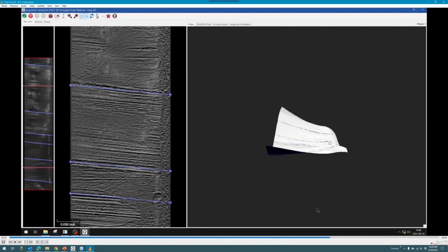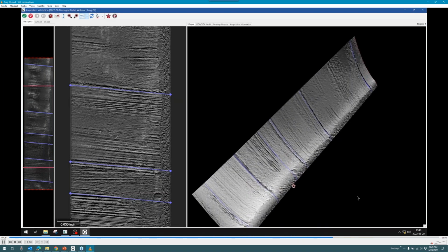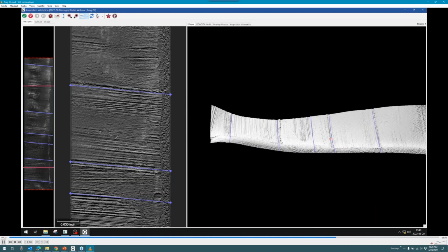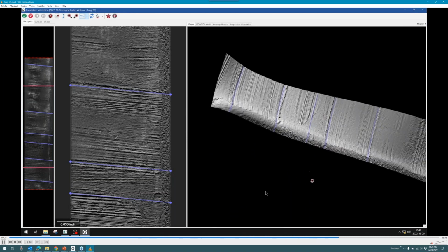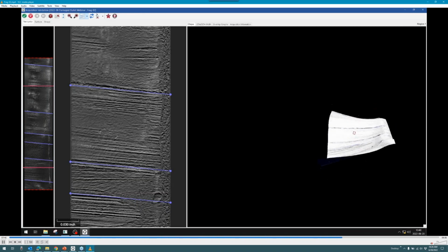We're seeing the actual original shape to it, and you can see the bends that were happening in the metal on that surface there. Quite a dramatic twist from where we began over here to where it ended over here. This is all just a little extra step right now for the sake of seeing what that shape looked like.